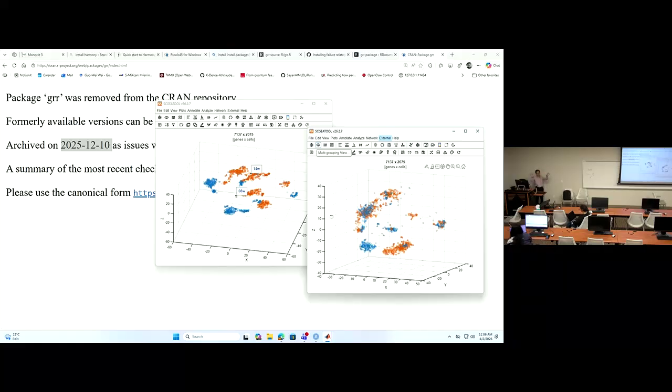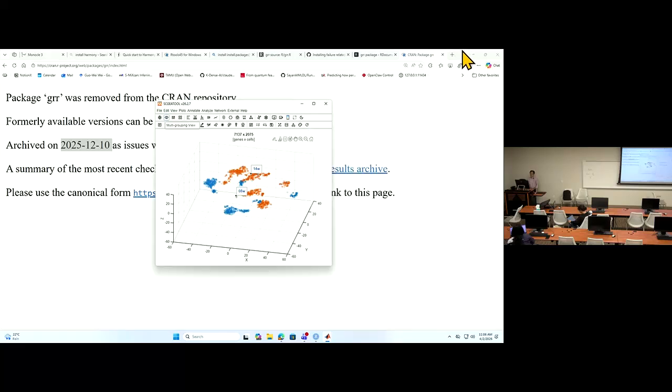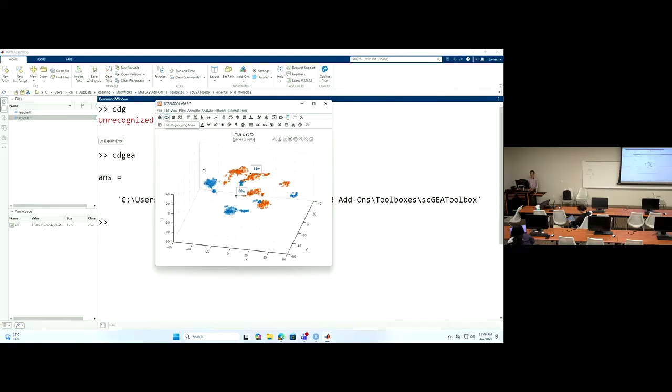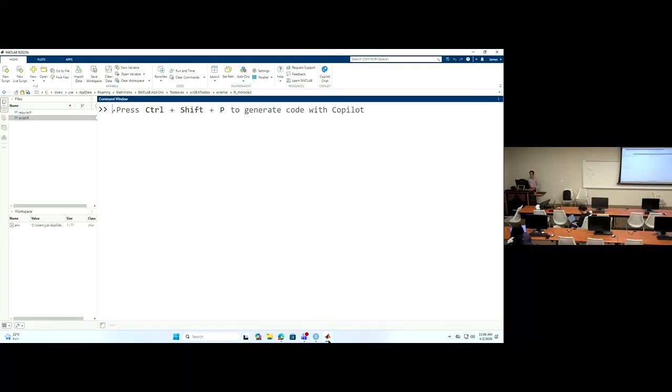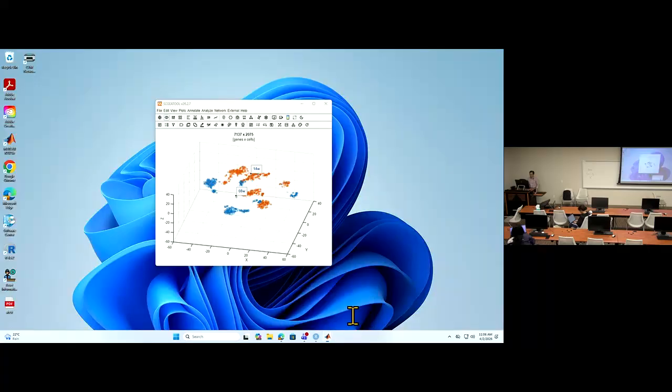So I think our question is within the alpha cell from week 8 to week 14, whether there's a trajectory we can follow. So I'm going to extract only alpha cells and clean the data and send it to Monocle to get some results and see whether we can do anything with it.